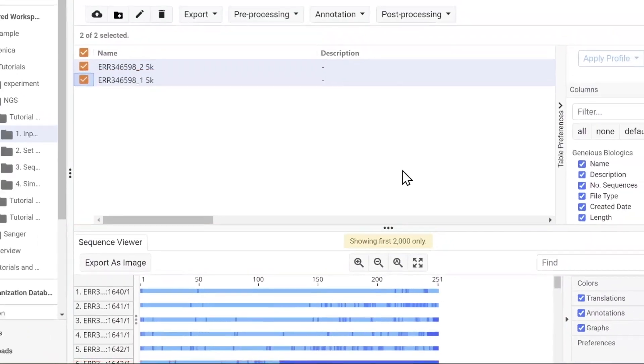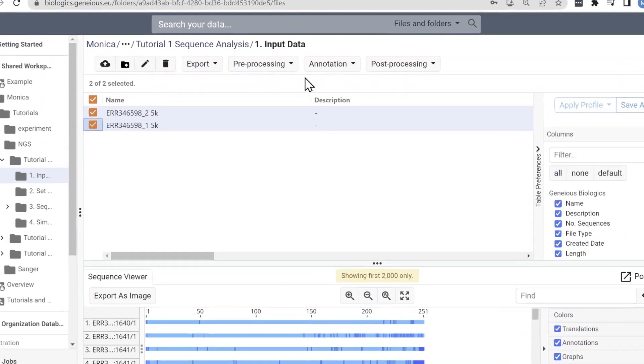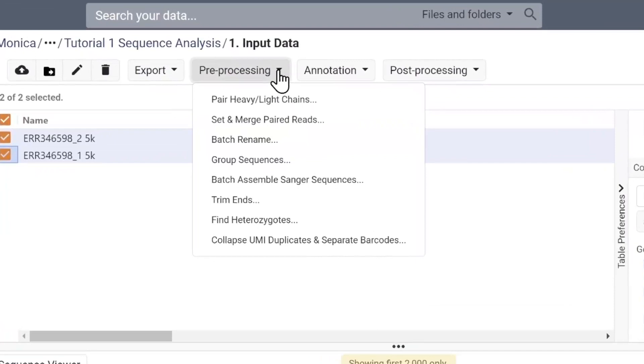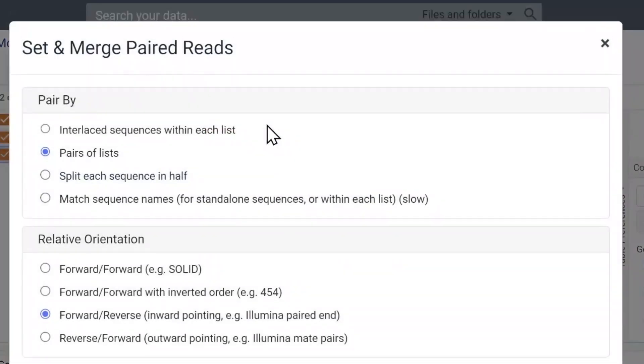To obtain complete antibody sequences for annotation, we first have to merge the forward and reverse reads. To pair and merge the sequences, select both sequence documents and select set and merge paired reads.